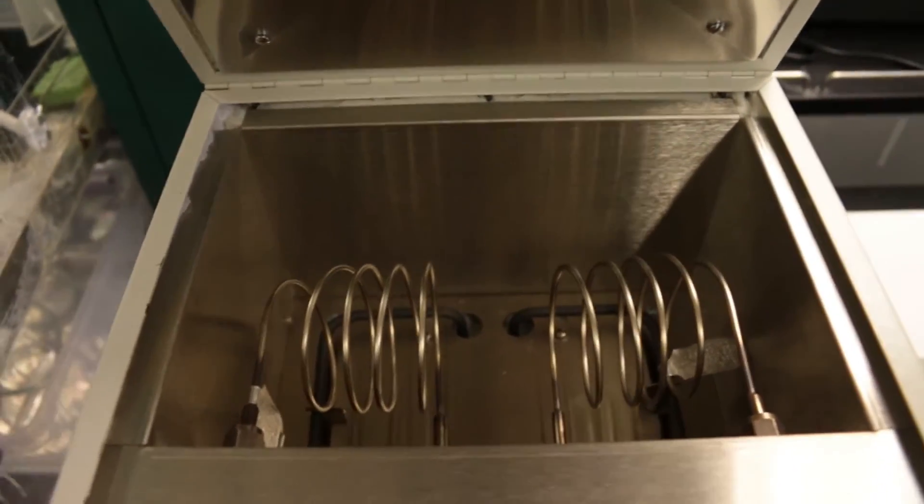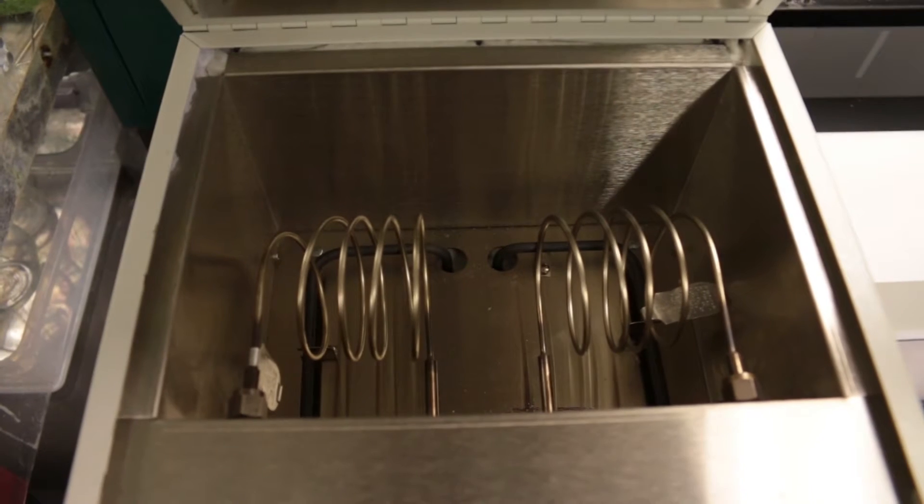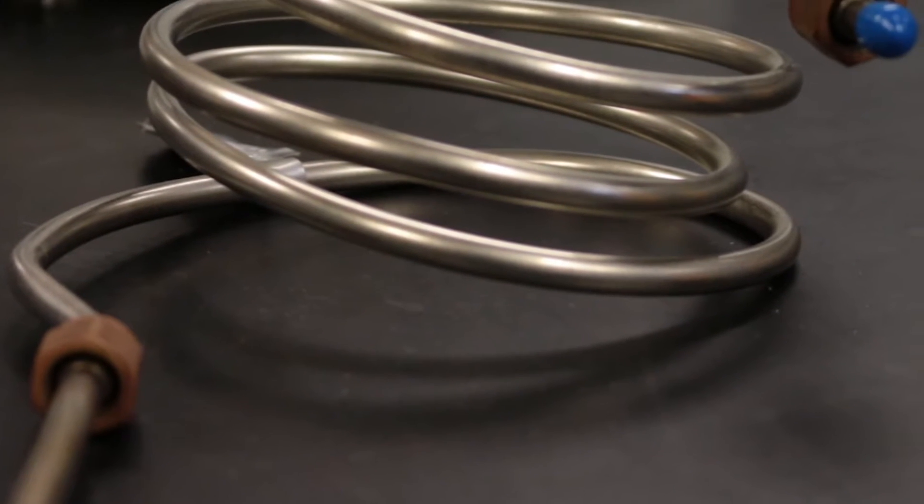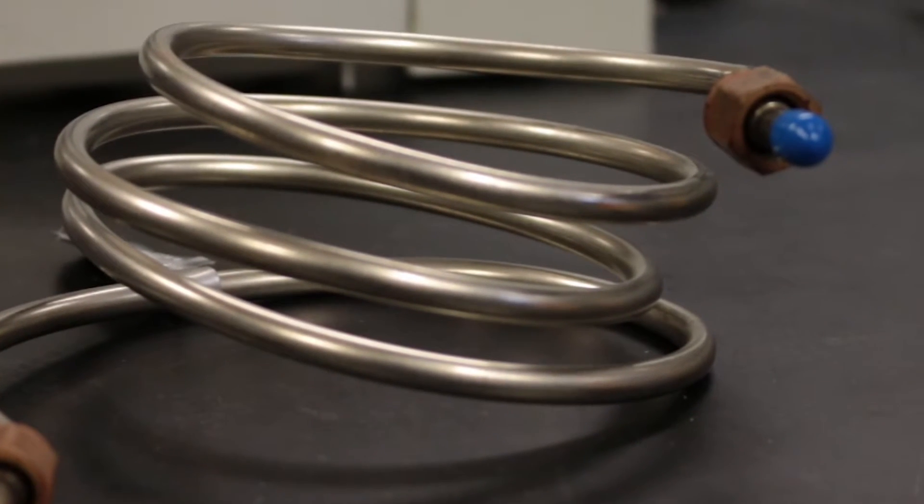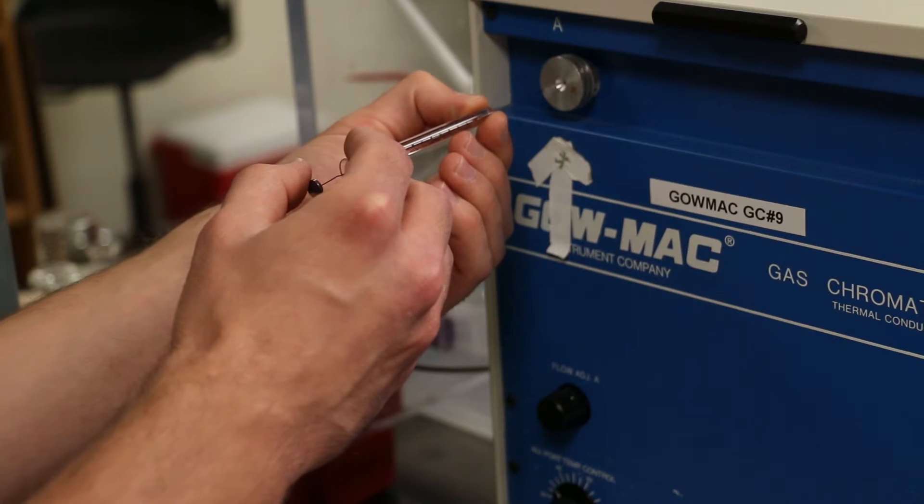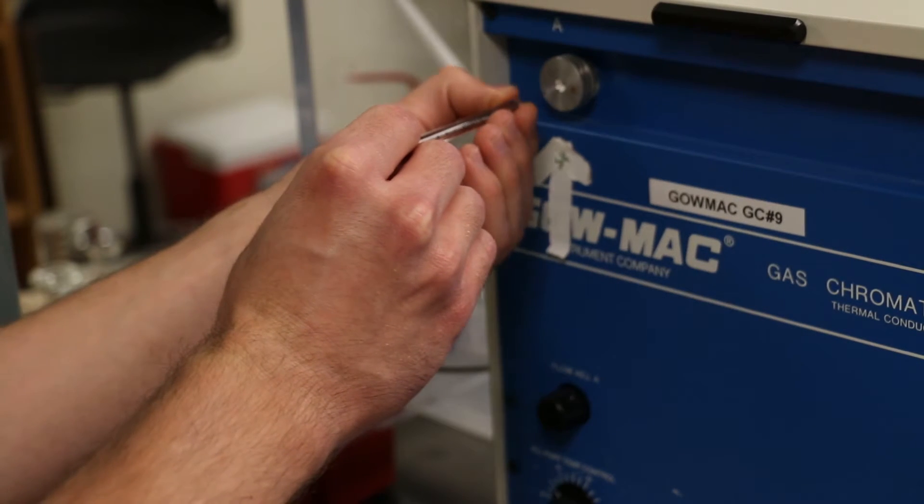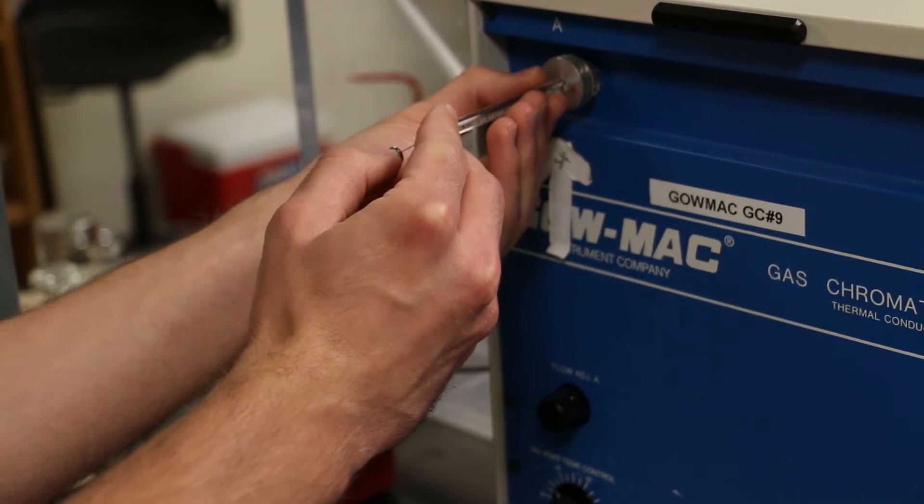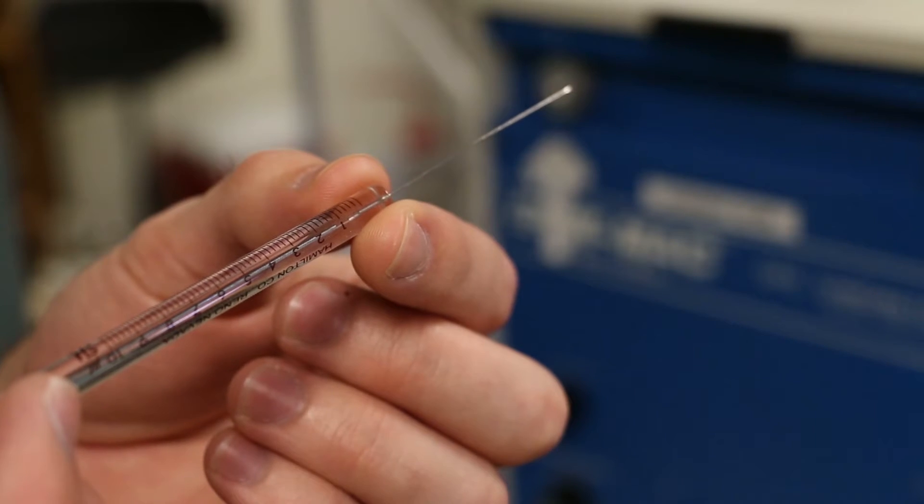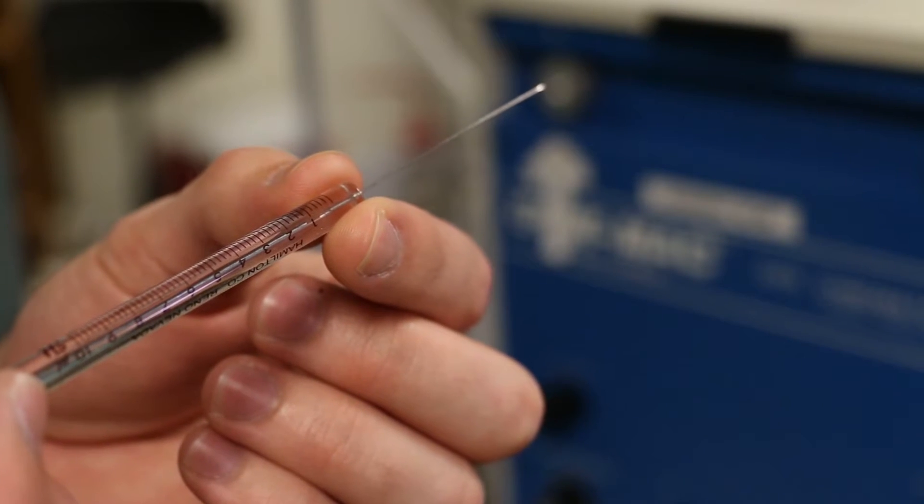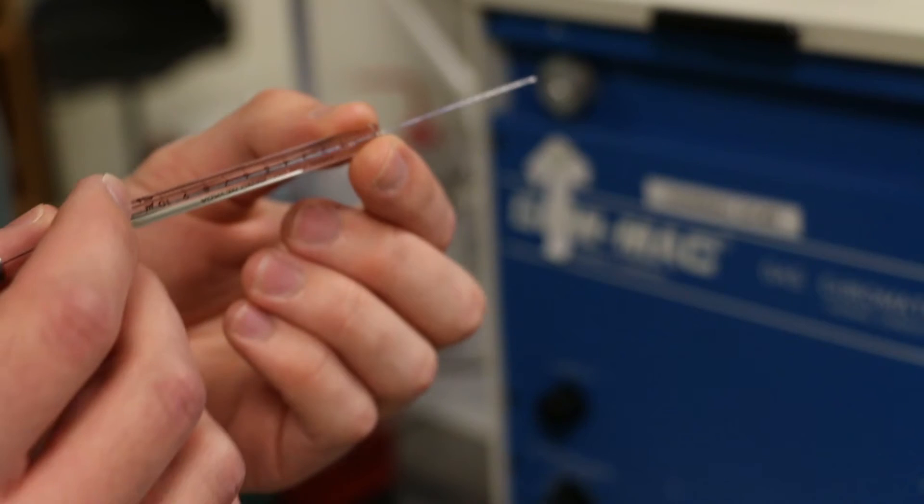The GC has a built-in detector that detects compounds as they leave the column and sends the signal from the detector to the integrator. A microliter syringe is used to introduce the sample through an injection port onto the GC column. The microliter syringe is a delicate instrument and needs to be used precisely to obtain good results.